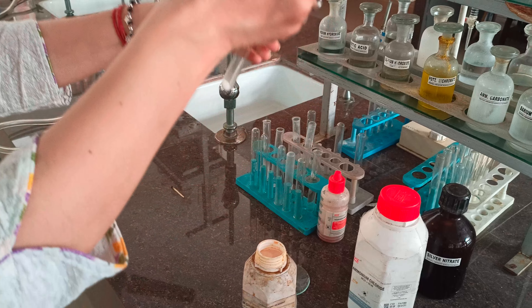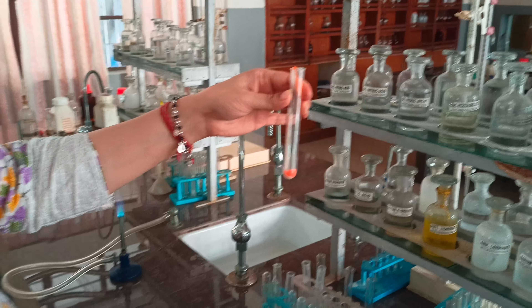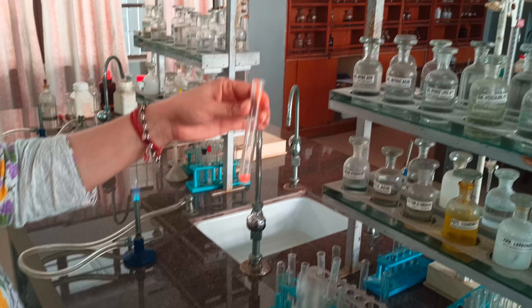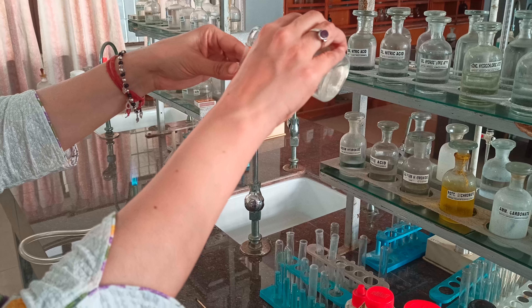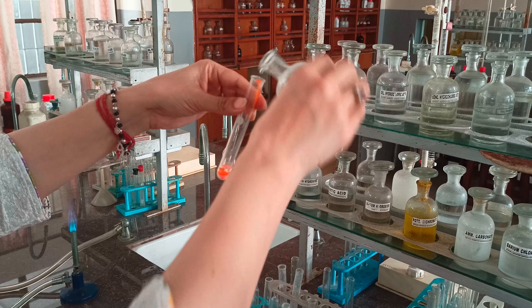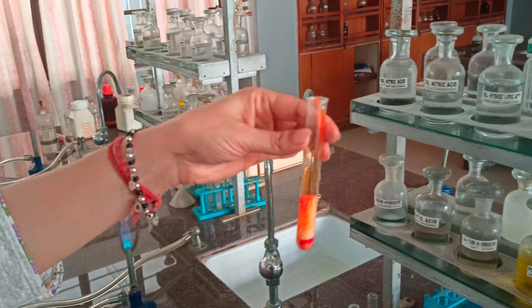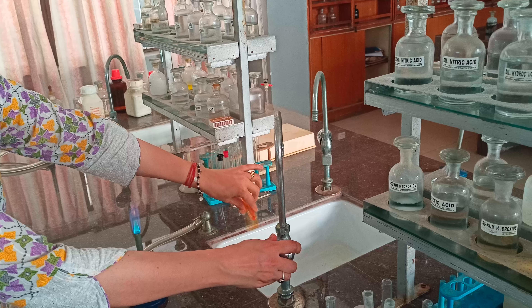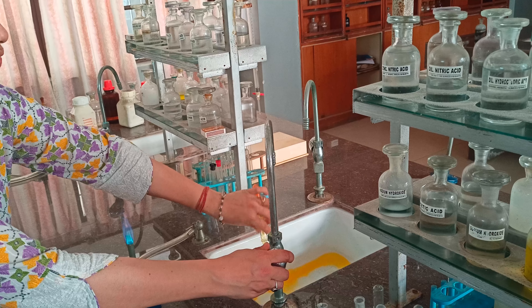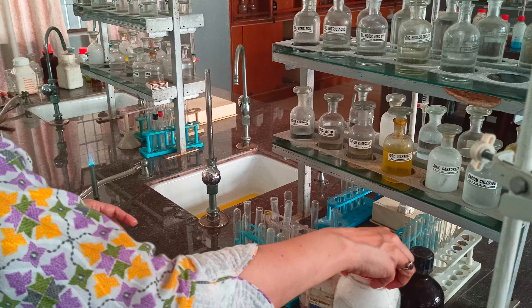We are going to add nearly the same quantity of potassium dichromate, then add concentrated sulfuric acid. Orange-red fumes of chromyl chloride with a pungent smell will start coming up. Chromyl chloride is formed — this confirms the chloride ion.